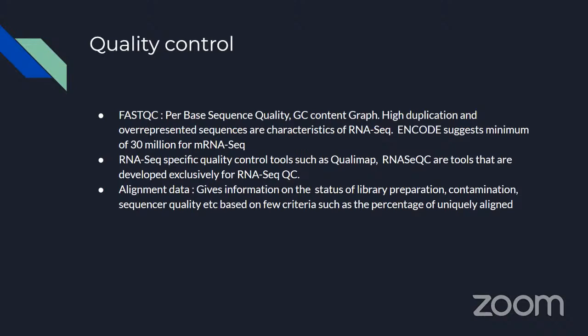There might be some amount of reads mapping to intergenic and intronic regions as well.